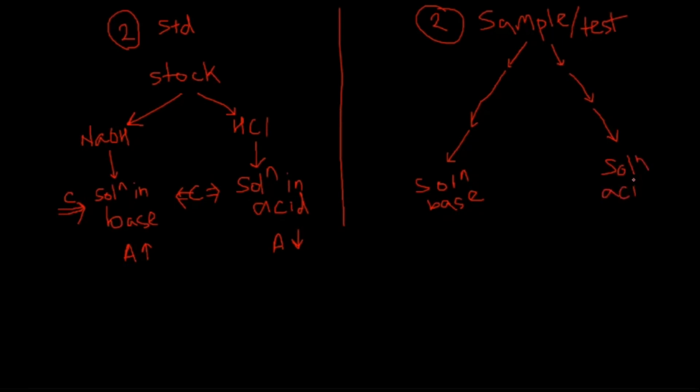Now, when we are preparing solution of sample, please consider that we are trusting whatever the label claim is. Okay, we are trusting whatever the label claim is. A label, if it is saying that each uncoated tablet contains 500 milligram of drug, we assume that the claim is right, and accordingly we prepare dilutions. Okay, we will calculate the quantity of powder to be weighed, then we will dissolve that powder in certain volume of the solvent. Okay, so similarly जैसे NaOH और HCl में बनाया था ये solution standard के लिए, वैसे ही हम solution बनाएंगे टेस्ट का NaOH और HCl में.